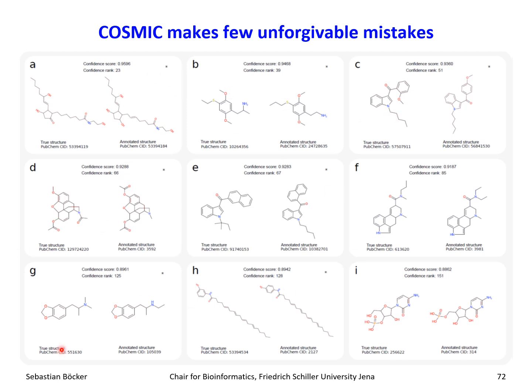By the way, there are loads and loads of correct annotations in between those nine incorrect annotations, hundreds of correct annotations. And what you also see is in many cases, those are the ones that have a star here, the correct answer was not in the structure database. So the method CSI FingerID didn't have a chance to annotate the correct structure. Bad luck. So it did its best and found this one. And then the confidence score said, well, I see this annotation. It's probably correct. It looks very nice. And there's nothing speaking against it. There is not the correct thing that could say, no, there's something very similar, you shouldn't be too sure.